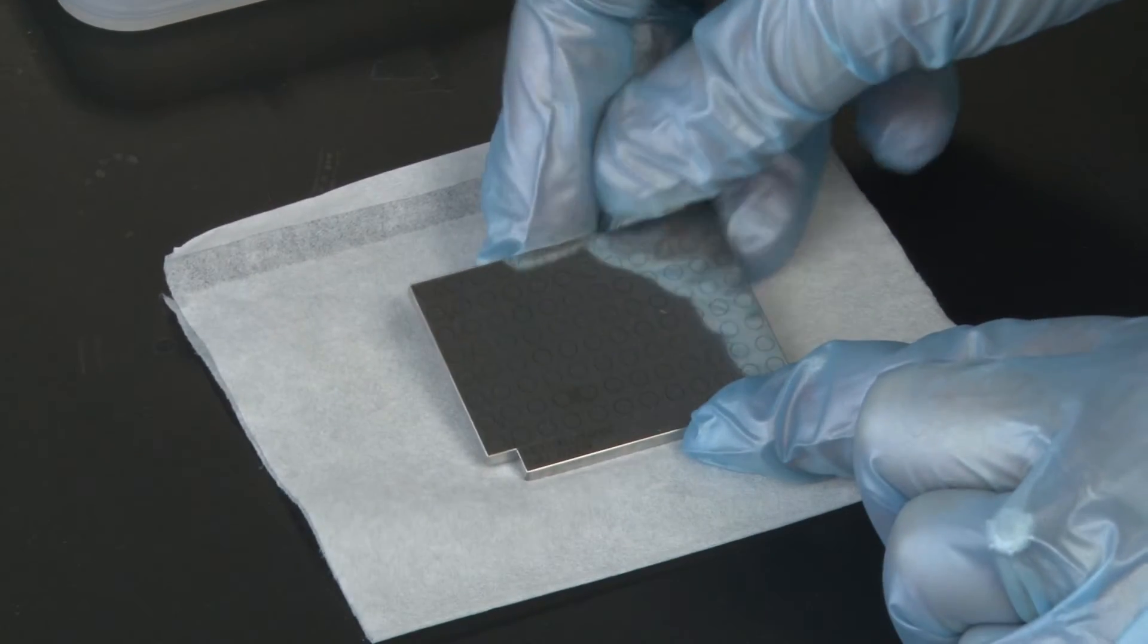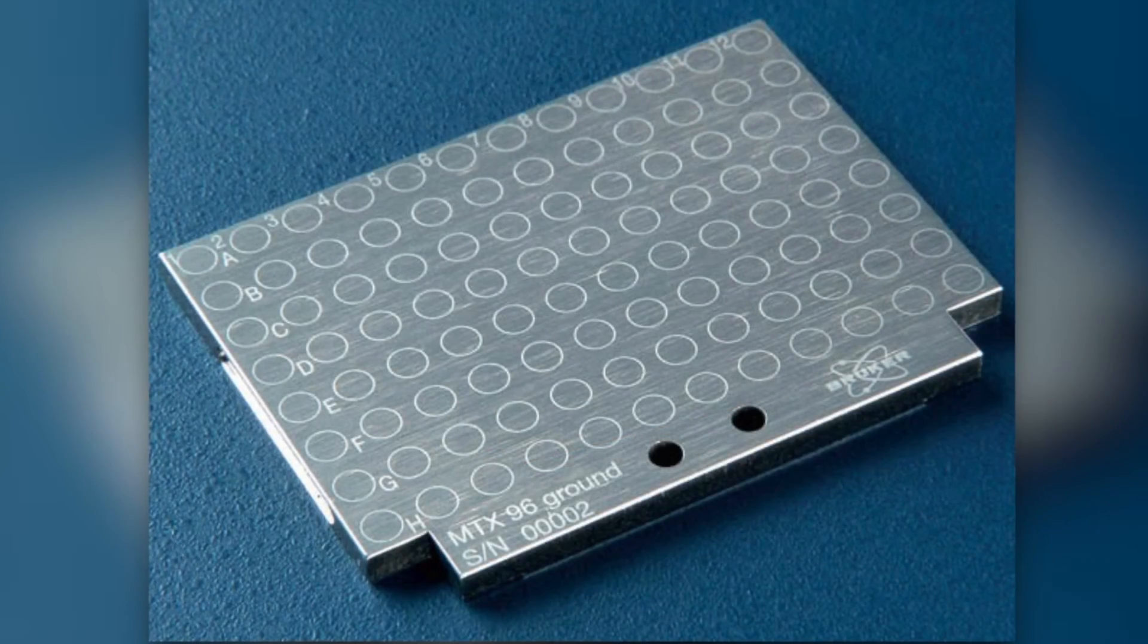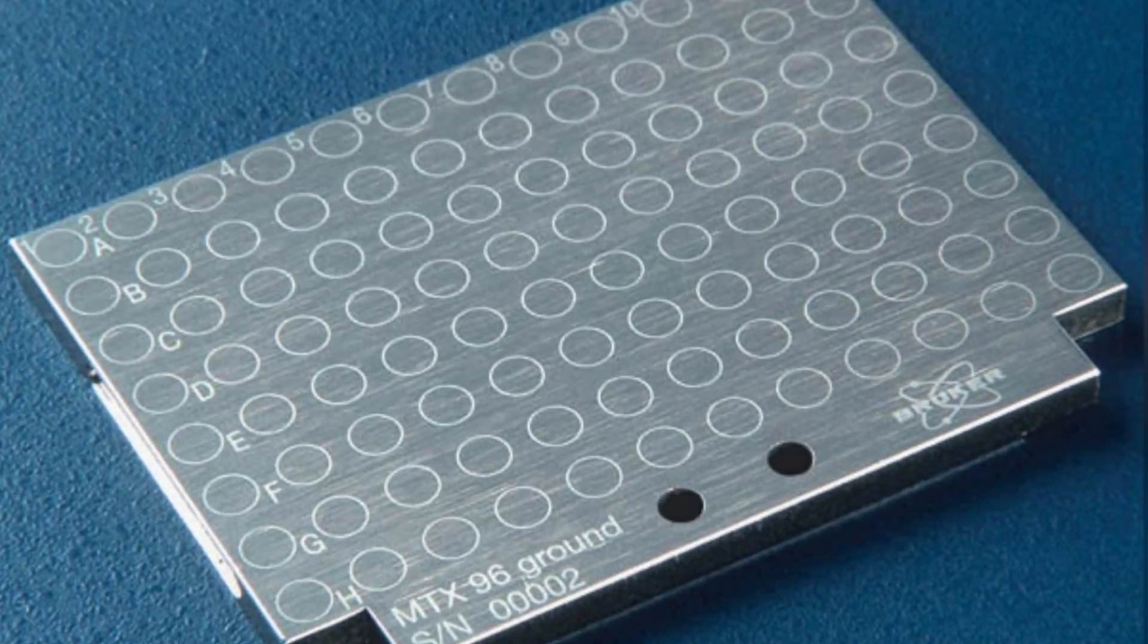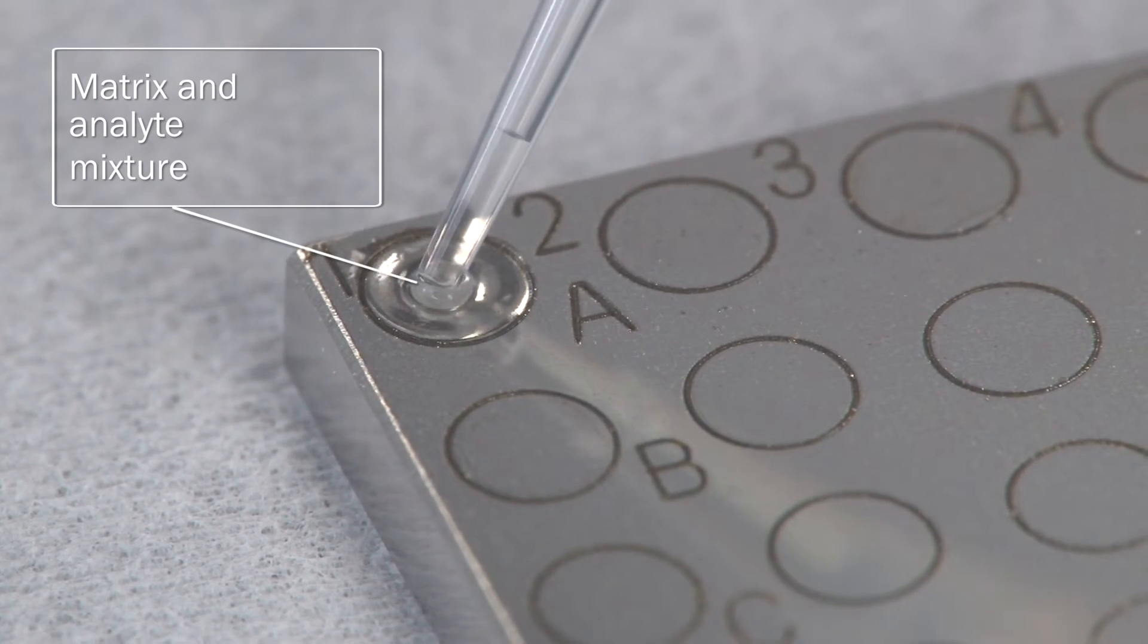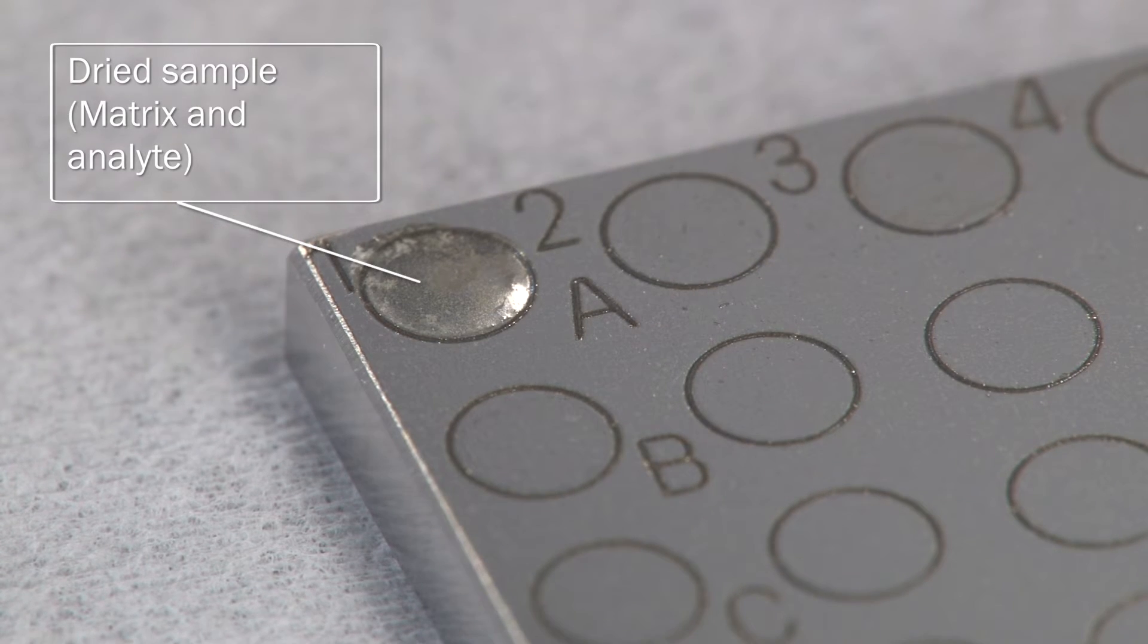Solutions of the matrix and analyte are deposited onto a sample plate known as the target. The target can be made of polished or ground stainless steel and has spots for several different samples to be applied. The solvent is allowed to evaporate from the sample solution, leaving behind a solid sample spot on the target that will be analyzed by the MALDI-TOF spectrometer.